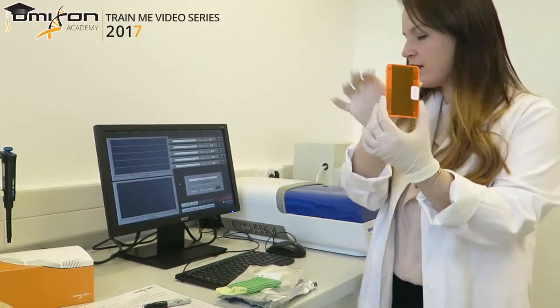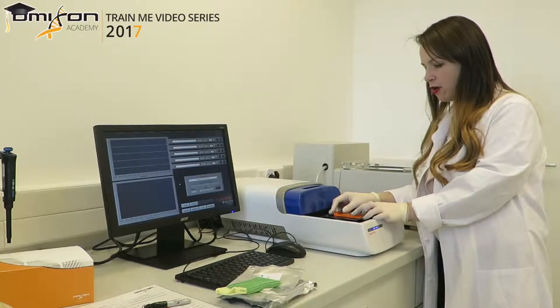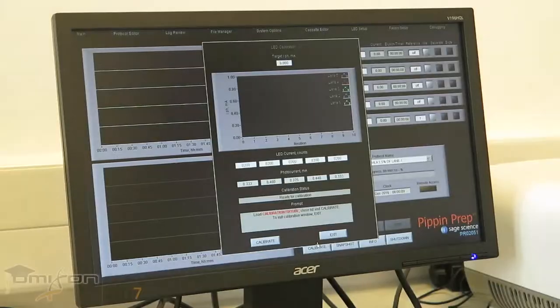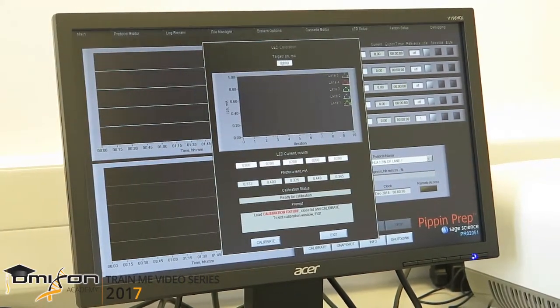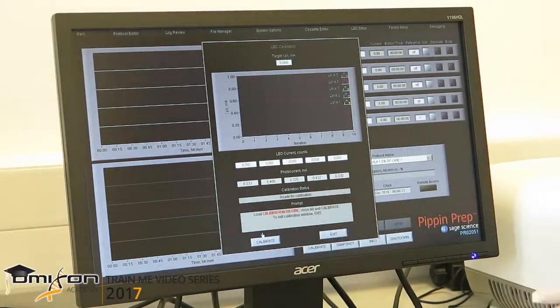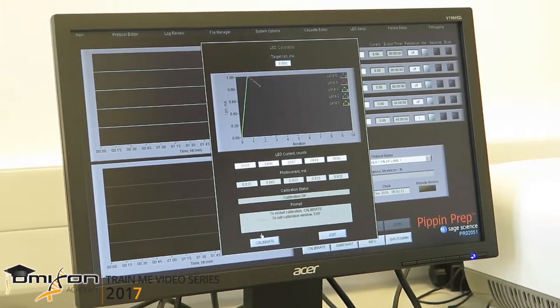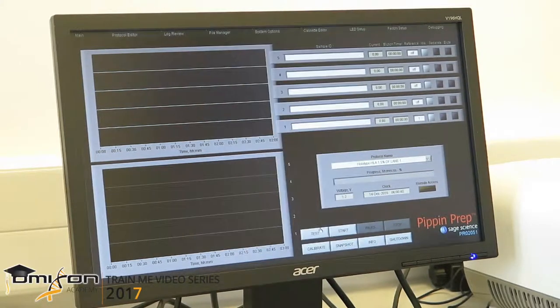You take the fixture, open the machine, and place it with the black stripe down, covering the LED lights inside. Then close the lid and click the calibrate button. A pop-up window appears — for the PippinPrep machine, the target IPH is 0.8. Everything looks correct, so I continue. I click calibrate and watch the calibration status. It literally takes seconds — it tells you it's underway and then it's done. I click exit and I'm ready for the next step.